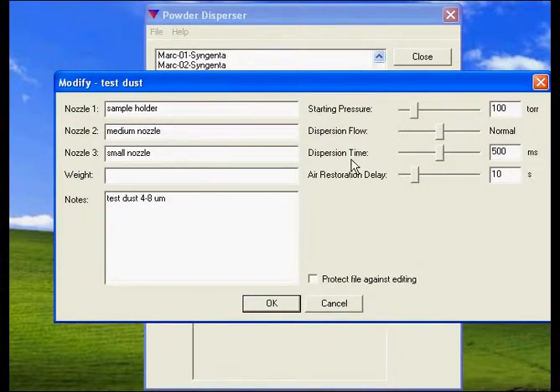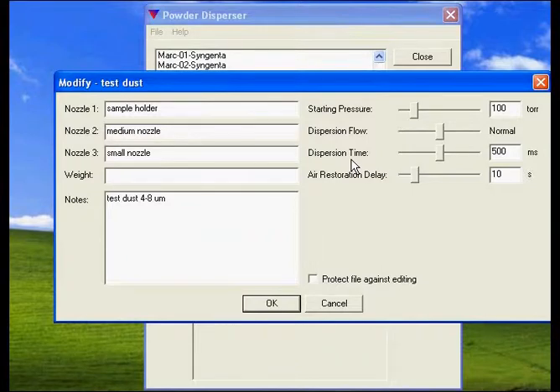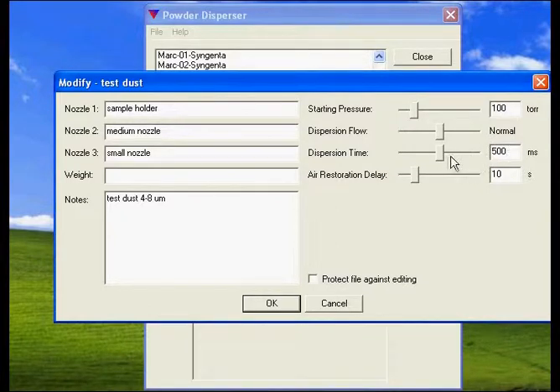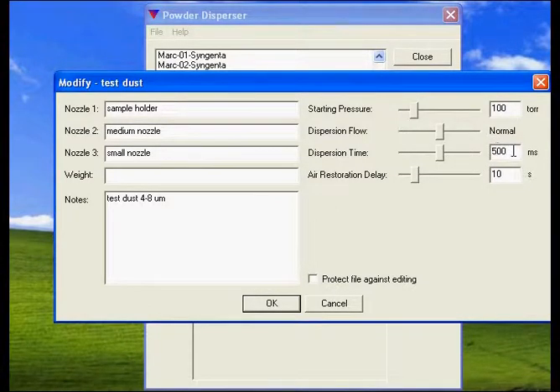The next step is that there's a small blast of air that will push the particles into the main chamber of the disperser. This determines the amount of time. I'll leave it in the center at 500 milliseconds.